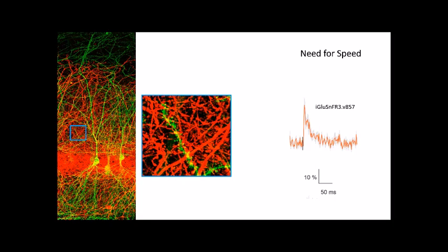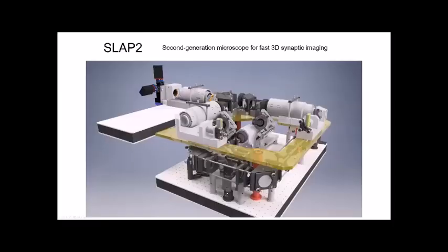But that's an extremely difficult task for existing microscopes. Neurons have many, many thousands of synapses. Even if we're talking about individual branches, we're talking about huge numbers of targets that are distributed in 3 dimensions, are very, very small, require the highest possible resolution, and the signals, even as indicators get better and better, are relatively small, and so we really need the highest possible sensitivity as well.